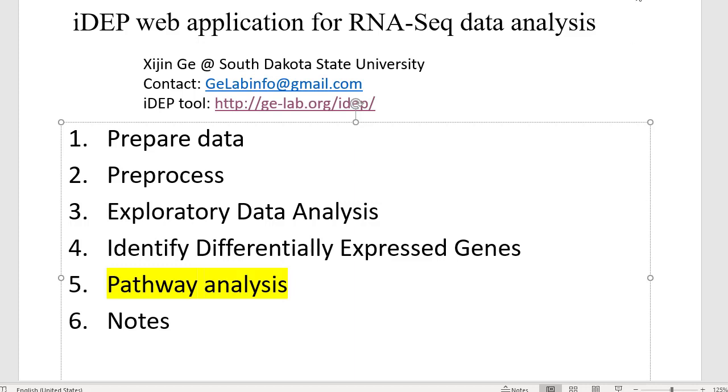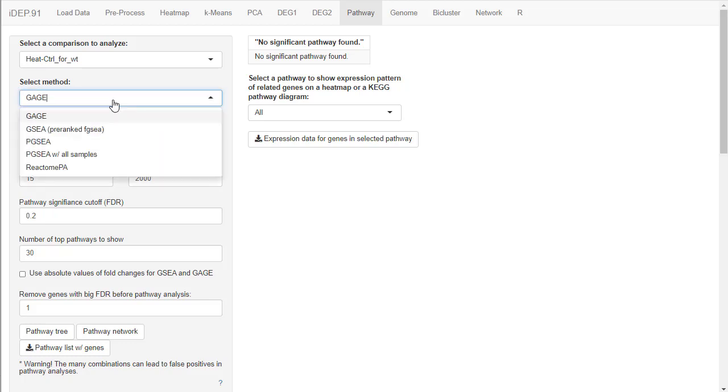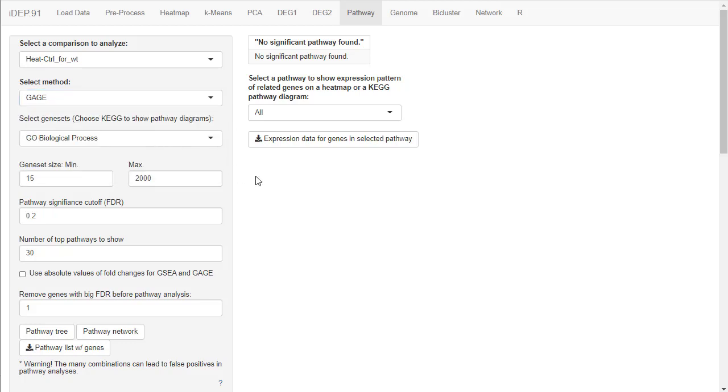One thing I'll stress here is that with tools like iDEP, it doesn't take much time. And with so many methods and so many databases, it's very easy to find something you're looking for. If you try different settings, it's very easy to find the story you're trying to create. So this is called p-hacking, or selective reporting, and should be avoided. This is the number one thing that worries us as developers of iDEP, that it will be misused by people to tell the story they want to tell anyway.